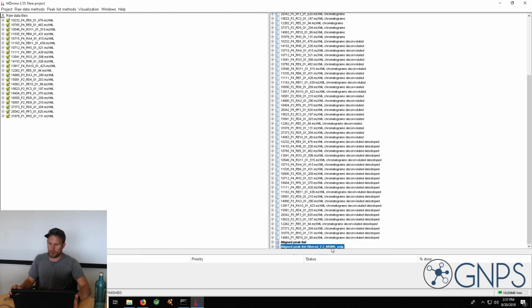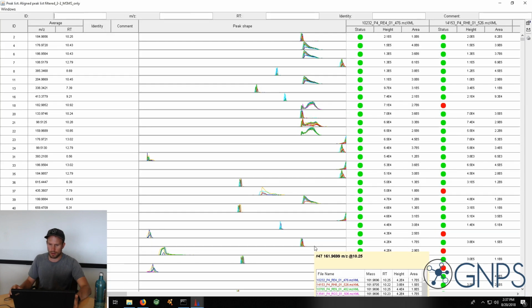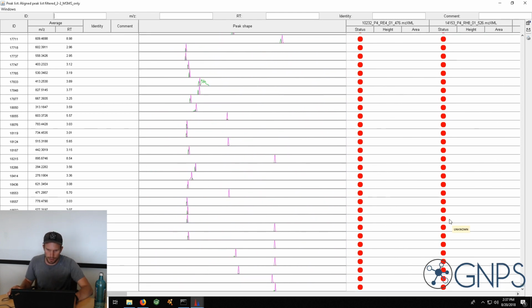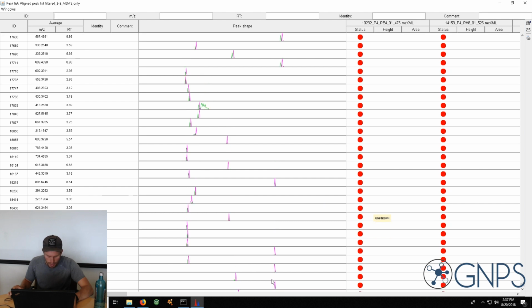Now, when we open this, you should see that at the top there should be fewer of the spikes. So there are still some peaks which maybe do not look super great because they were close to the limit of detection from all settings, but definitely better than before.